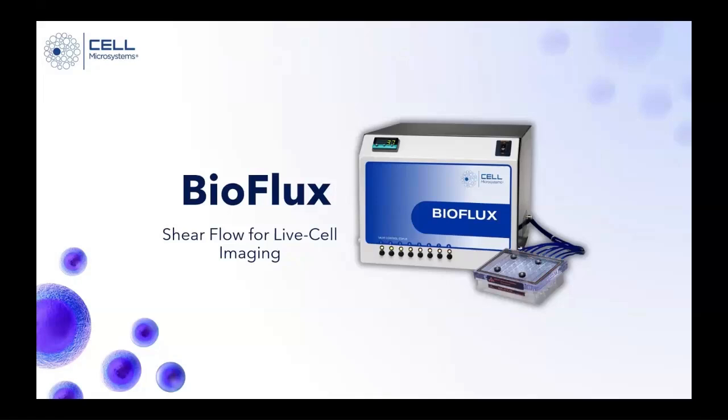Today, we'll demonstrate an experiment that models immune cell recruitment to an inflammation site under shear flow using the BioFlux. Specifically, we'll track the adhesion of Jurkat cells, a human T cell line, to a TNF-alpha activated monolayer of cardiovascular endothelial cells that is undergoing a state of inflammation. Before heading into the lab, I'll give you a quick overview of the BioFlux, our shear flow technology that enables physiologically relevant experiments at high throughput.